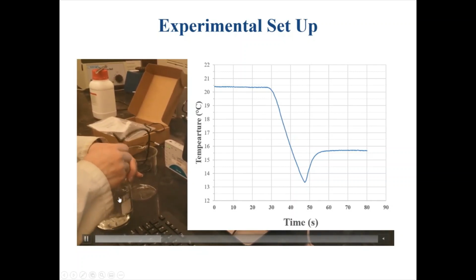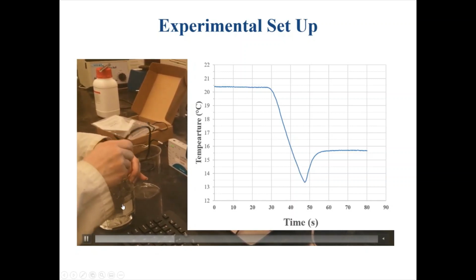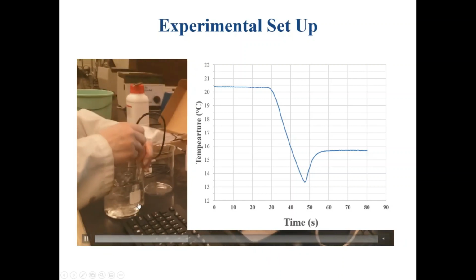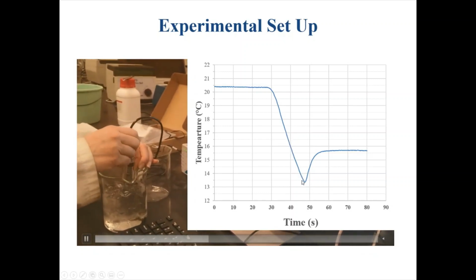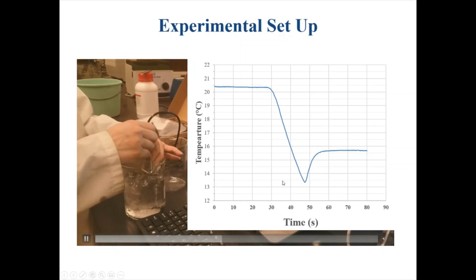Now, if you look very carefully, as we're cooling down, there's going to be a moment where we start to see solid. So watch this area very carefully, and then you'll see it. Here we're continuing down our curve as we're cooling, and it may take a few seconds.